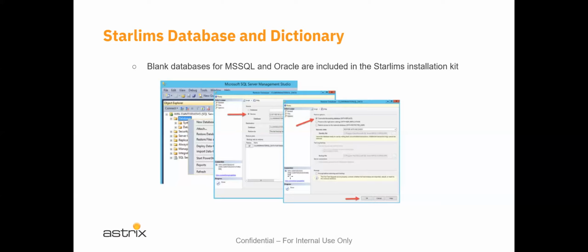But at the end of the day, you could work on either one. Because if you go to a client site for a pharmaceutical environment and open up the designer and start looking under the hood, you'll say, hey, wait a minute, these are all the same tables and the same fields and the same tools that are in the pharmaceutical as opposed to the forensic model. So it's designed specifically to operate in different environments based on the need for a specific client, but the toolbox is always the same.